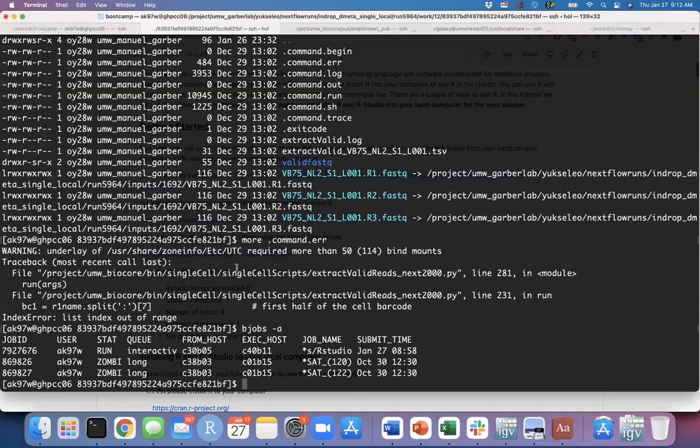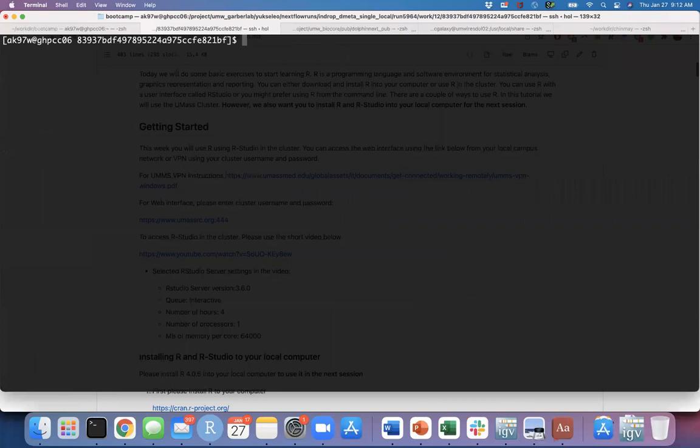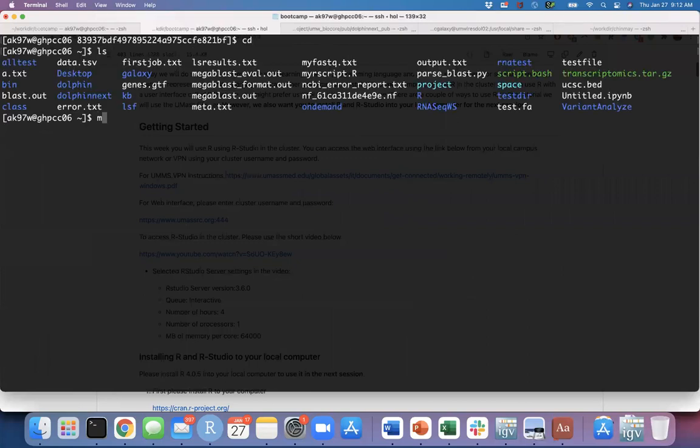many versions of R in the cluster. So I'm just going to show module avail. And there are many ways to use R. If you are running something like single cell RNA-seq analysis in R, sometimes I use the cluster because my laptop is sometimes busy or is not that powerful, or I need stronger computers. So I'll show you how to use this in the cluster.